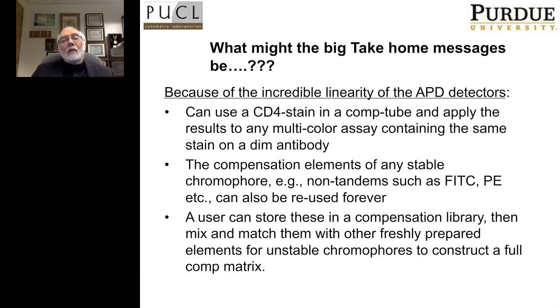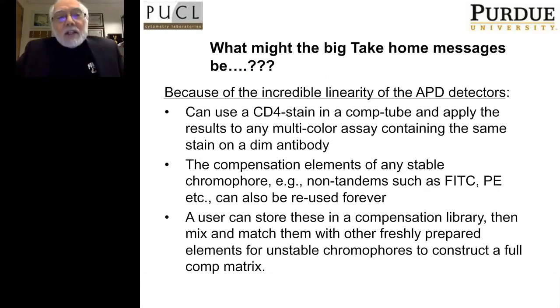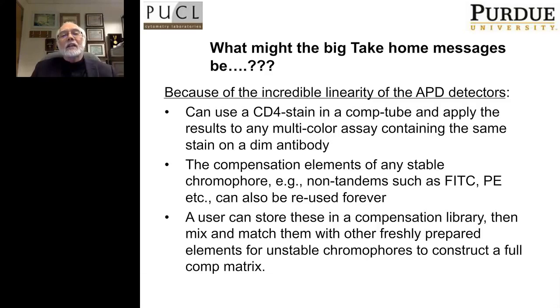So what would be the take-home messages? You might be a little surprised at what I think the key take-home messages are from this system. I don't think it's that the system is using APDs, or that the system uses wavelength division multiplexing, or that any of these things that I've shown you are in themselves super special.